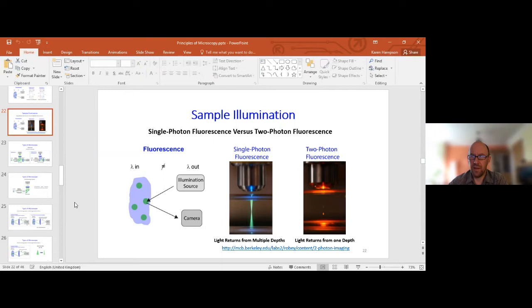The difference between fluorescence and phosphorescence is to do with the photophysics. In fluorescence, the length of time for most of these dyes is on the order of nanoseconds. So between excitation and light emission is nanoseconds. In phosphorescence, the only real difference is that it follows slightly different processes and is hence a much longer time between excitation and emission. So I believe there have been applications using phosphorescence in imaging, but they're far less useful. So fluorescence is the ubiquitous method.